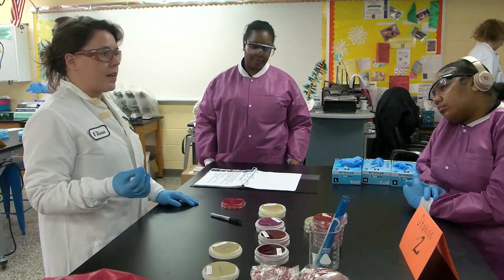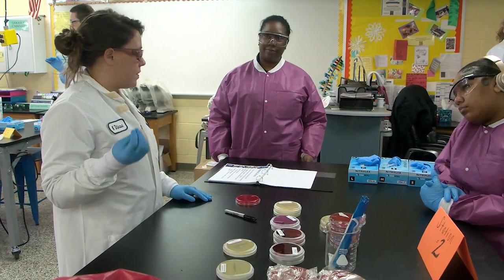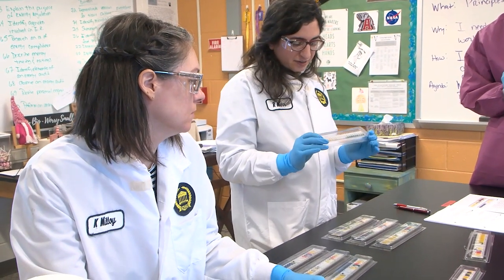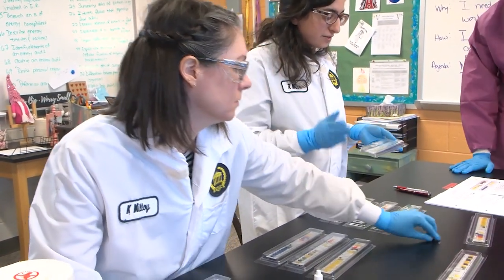Bacteria divide by binary fission, and they divide very, very quickly. It creates an anaerobic environment, which means no oxygen. This is an analytical profile index, and essentially what it allows us to do.